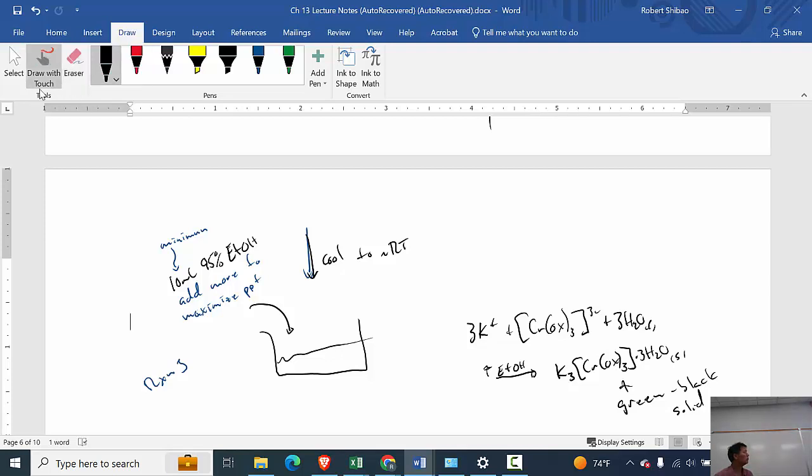what we're going to do is we're going to cool this in an ice bath. And so I get a bigger beaker. We started, this is a 250, so maybe I'll get a 400 or 600 milliliter beaker and then put in ice water here. Not just ice. Ice doesn't conduct heat very well. Ice water is a much better conductor of heat. And so we want ice water to cool it down. And typically, as it gets colder, the solubility decreases and we should get more precipitate.